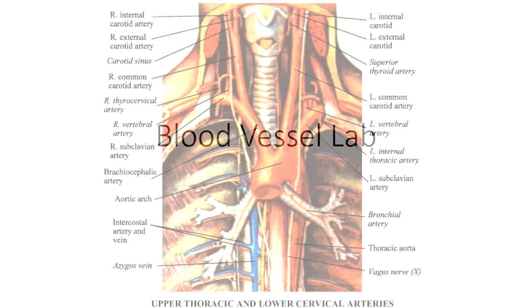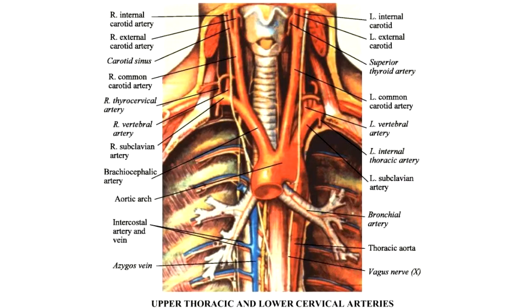Today we are going to cover the blood vessel lab. So let's take a look in our lab manual, and I'm just going to follow along in the lab manual and point out everything that I can on each of these slides. Here is our first slide.